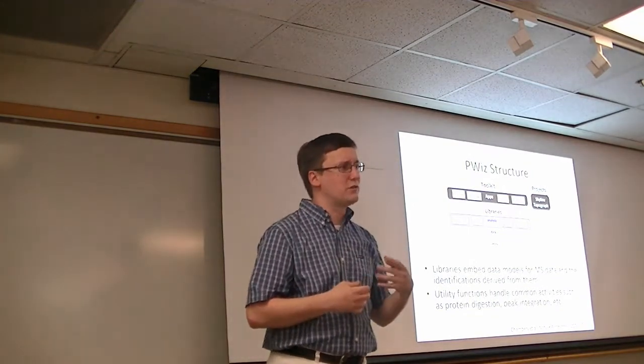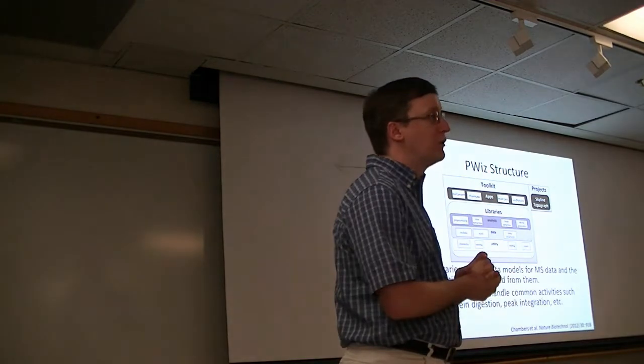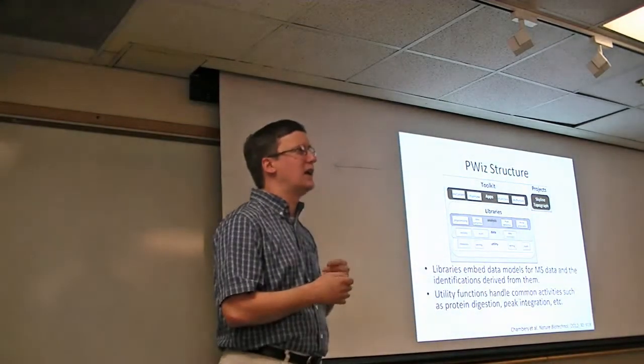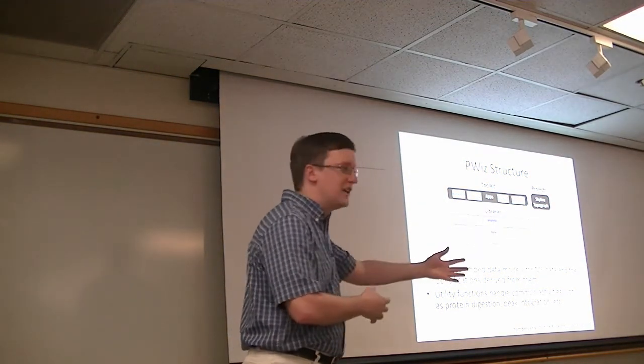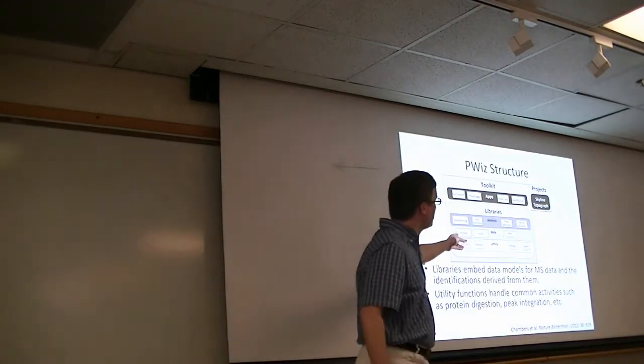Topograph was created by a great group that we work with out at Stanford. They've worked on things like protein turnover, for example, so being able to quantify these ions over time over different files is important. So these are some of the examples of things like that.